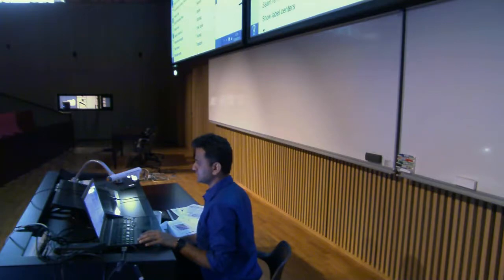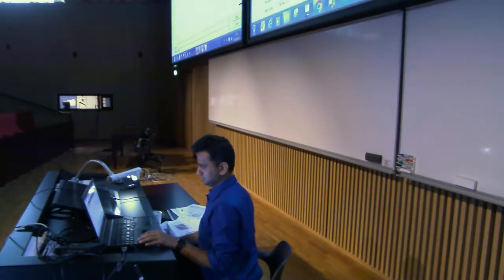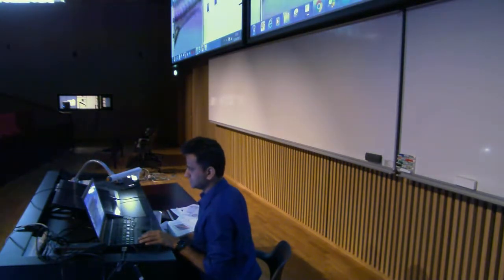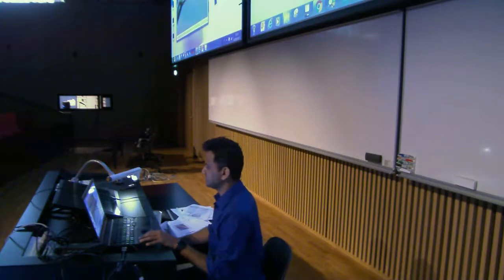If you have an image like this one, open segmentation, fish. This one, you can see here. See, it's out of focus, right? At some time point. So this time point is okay. This time point is fine. At this time point, it's blurred, right? It's out of focus. So how to correct for this? That is possible using the extended depth of focus.